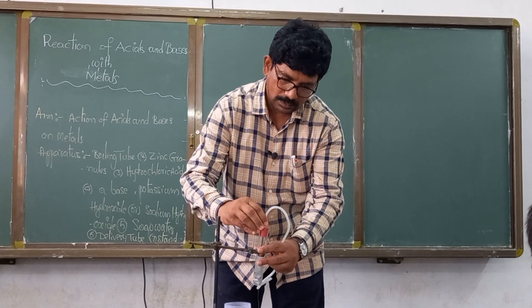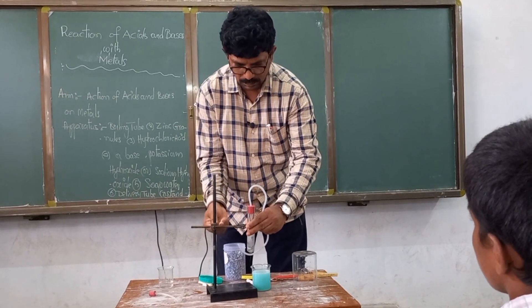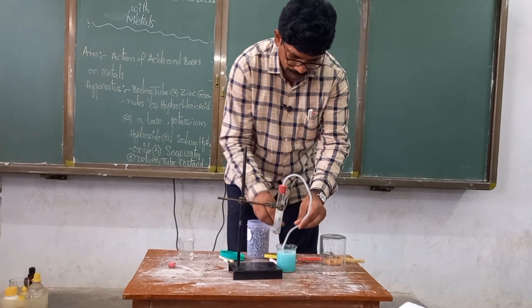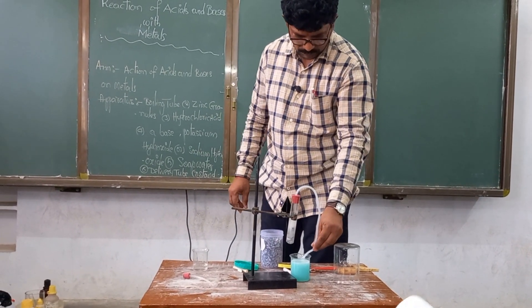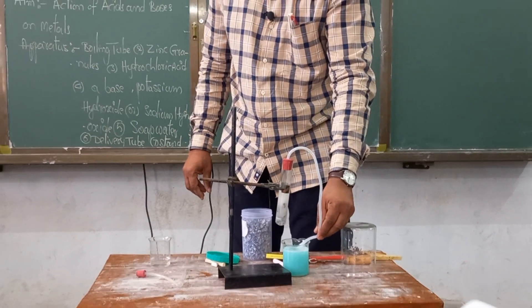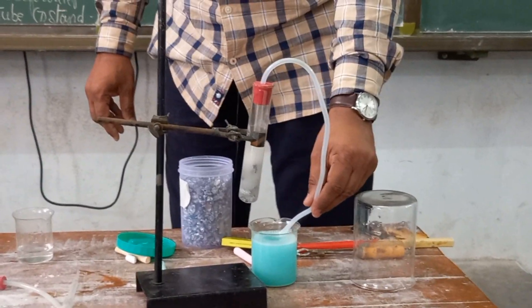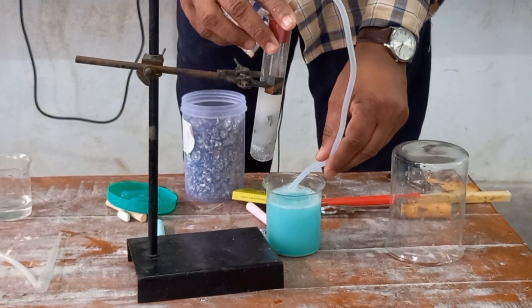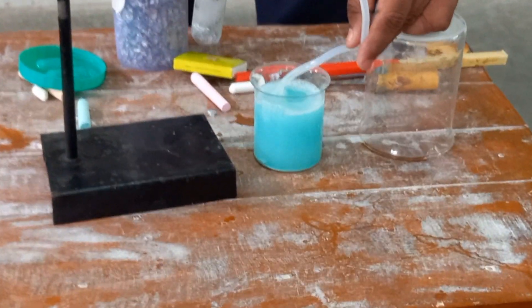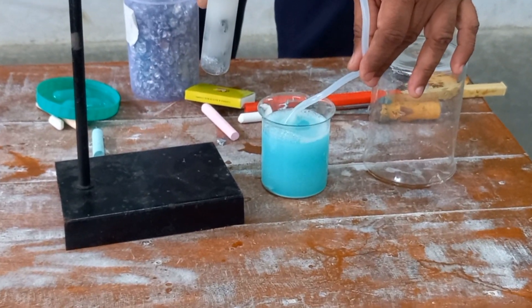Wait for some time. I kept the delivery tube into the soap water. The reaction is going on. Do you find the bubbles? Yes. Gas is evolving. Gas is evolving when acid reacts with the metals.